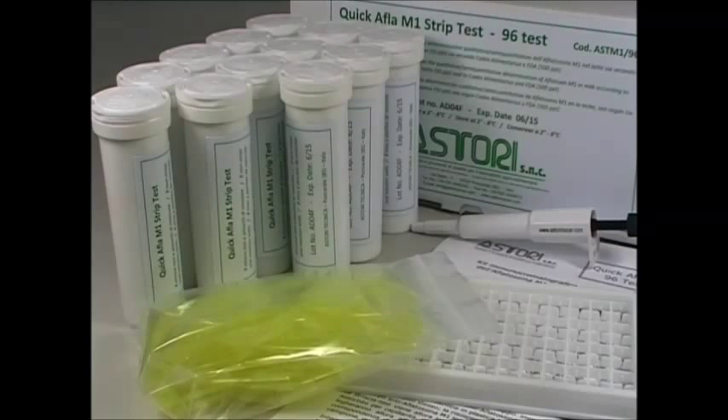The kit includes 96 reaction microwells and 96 test strips parted in 12 cylindric tubes with drying caps, a reusable micropipette, 96 disposable plastic tips, a reusable frame and a user's manual.